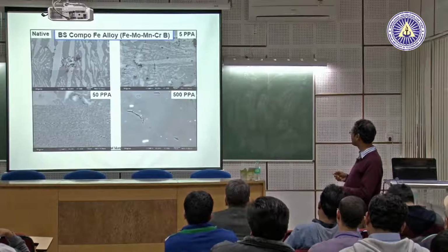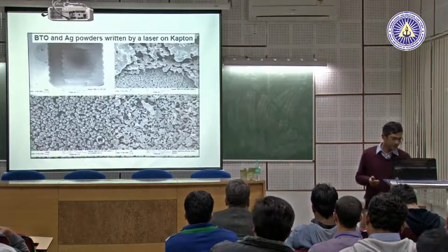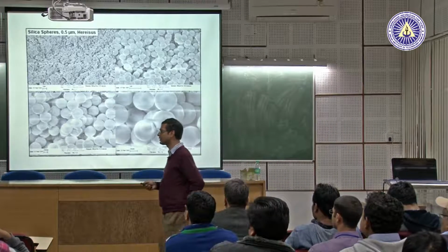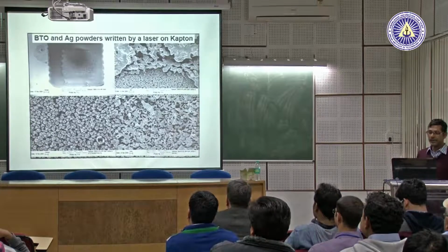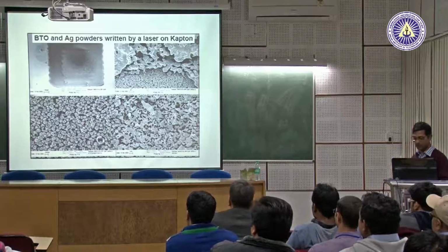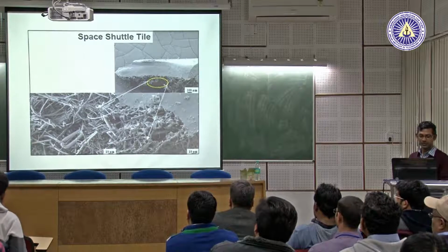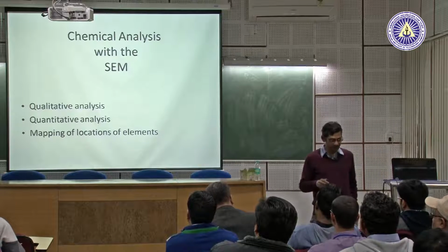I don't know what is PPA. It's some polymer, carbon related stuff which has been coated on the surface. So in the previous image, we have these white regions. These are again because of charging only, not fully gone. And same thing here also, magnified to different levels. Again, these are all from different pictures. So I have just briefly given you an idea.